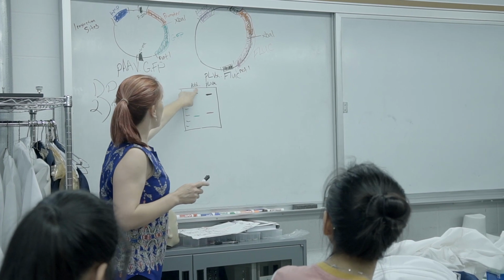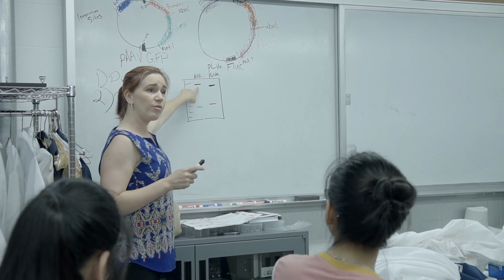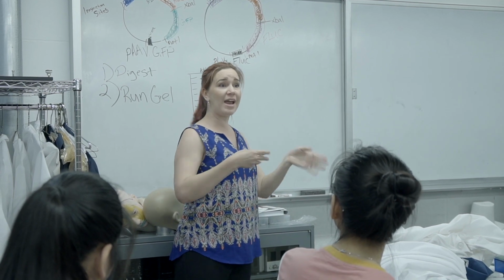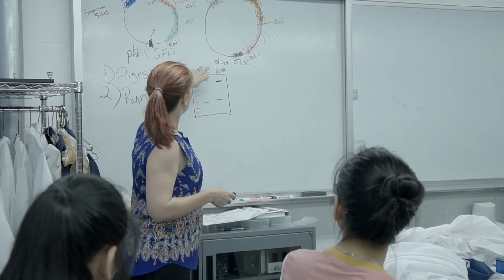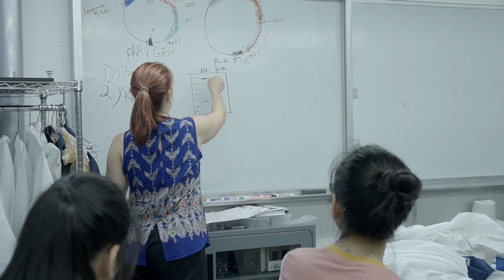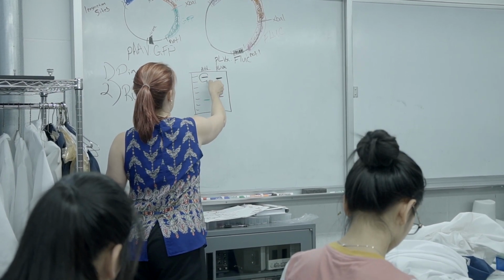So all of my DNA is right here. And actually a really cool property of the gel is you can dissolve it and purify out your DNA. So I've actually collected all the DNA I'm going to need right in this band. So we're going to cut out actually this top band.